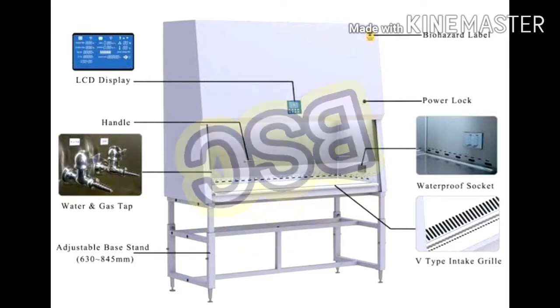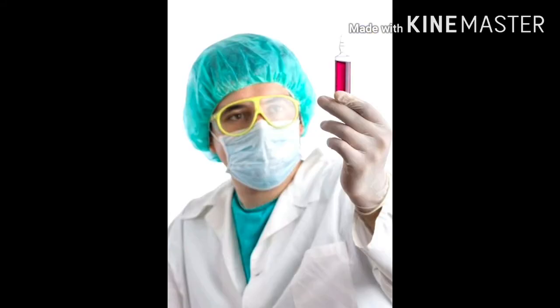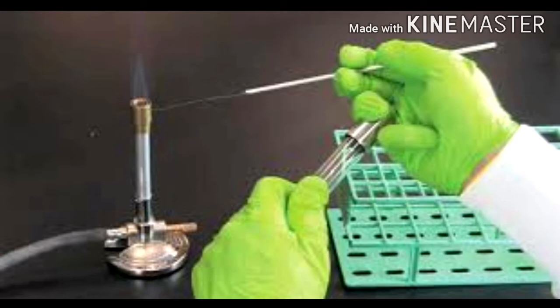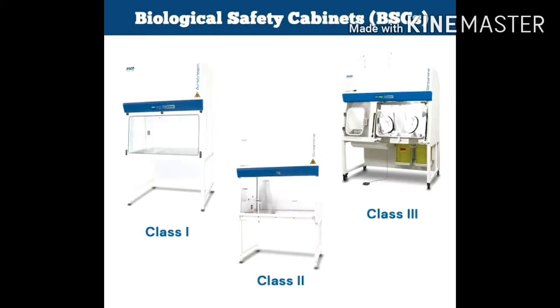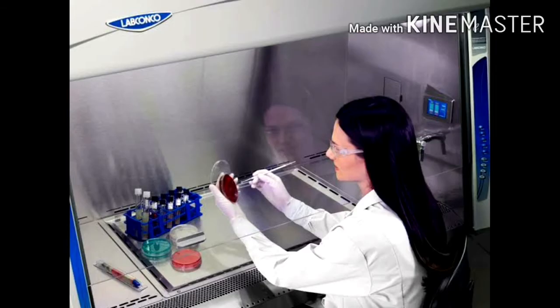The biological safety cabinet, or BSC, is the principal device used to provide containment of infectious splashes or aerosols generated by many microbiological procedures. Three types of biological safety cabinets are used in microbiological laboratories: Class 1, Class 2, and Class 3.